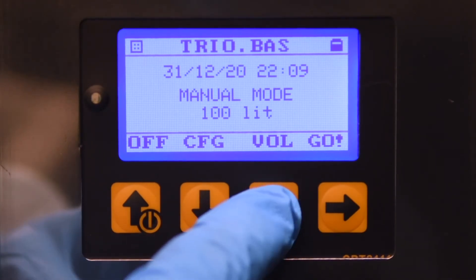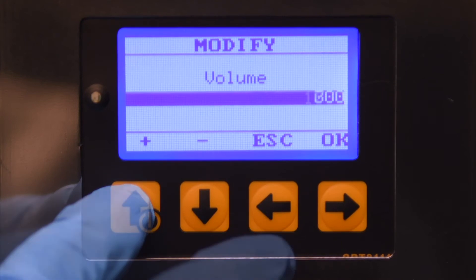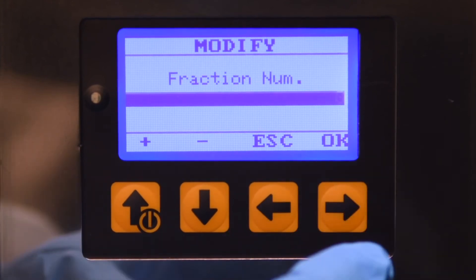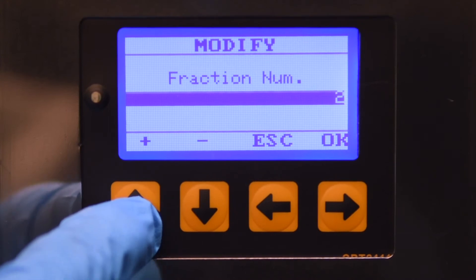In manual mode, the operator can select the sampling volume, a sampling delay, the number of the sampling cycle, and fractions or interval times between sampling.